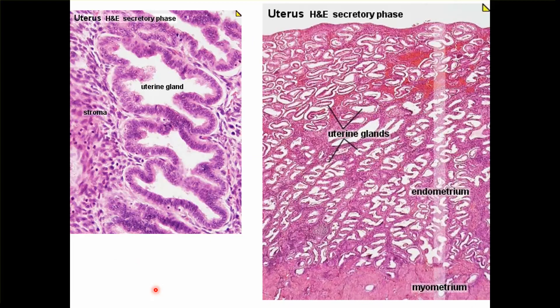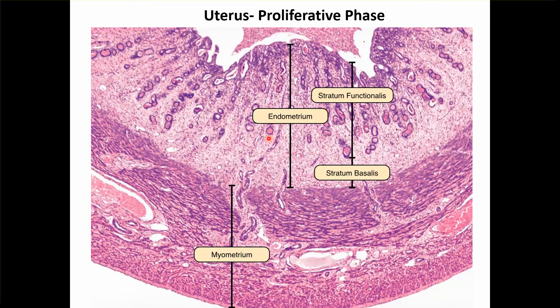Here we can see the secretory phase — the glands are all dilated showing a corkscrew appearance. In the proliferative phase the glands are not as dilated as in the secretory phase, and the spiral arteries just start growing but have not yet reached the superficial layer.